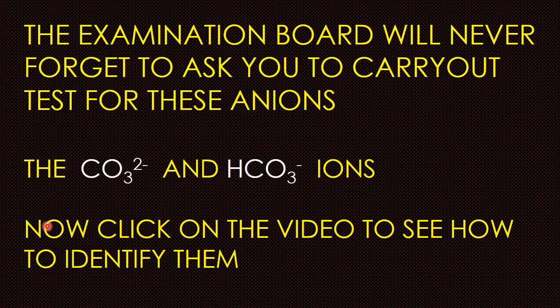In this video today we shall be looking at how to carry out experiments in the laboratory to determine the presence of the carbonate and the hydrogen carbonate ions. So guys, stay tuned and watch the video from start to finish, because at the end of this video you shall be able to determine the presence of these two ions.